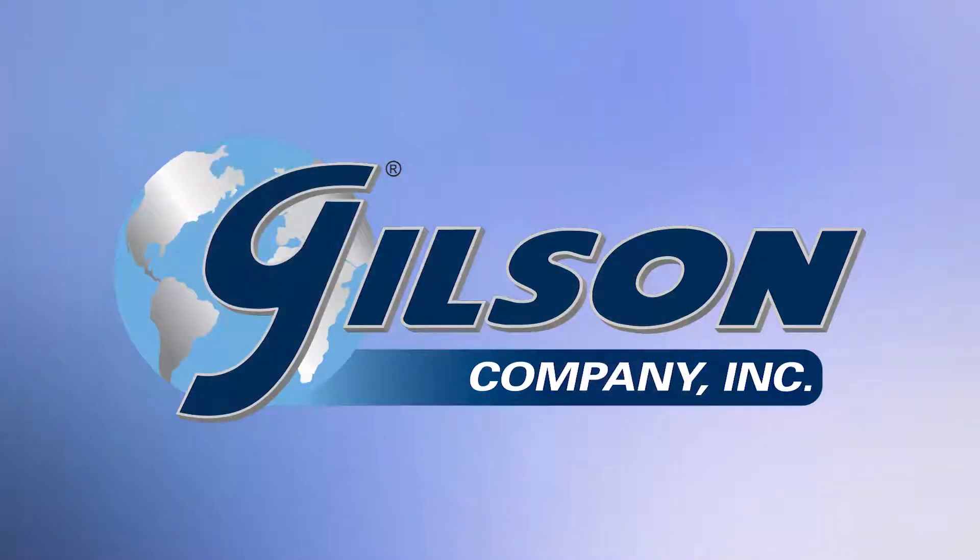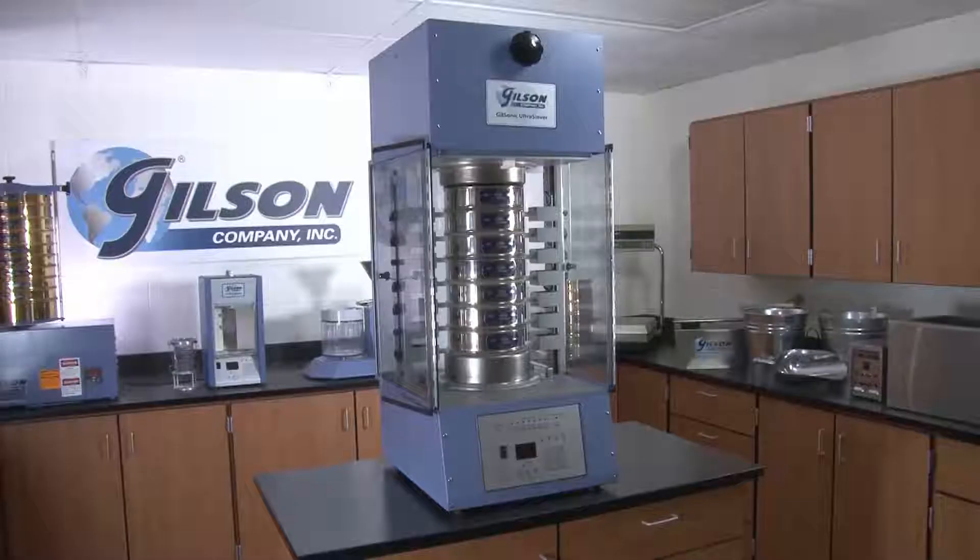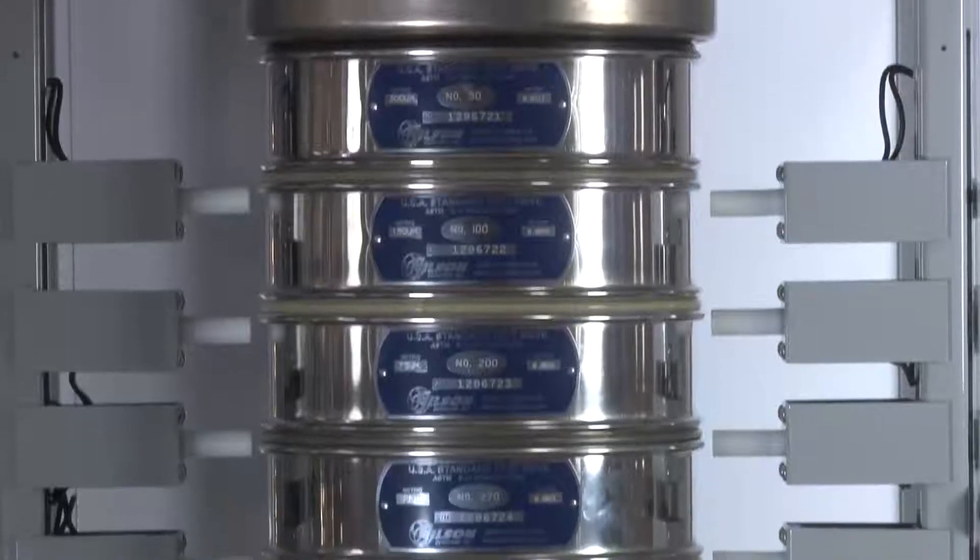Let's take a look at some of the exclusive features of the Gilsonic Ultrasiever Sonic Sifter, which combines proven sonic technology with the latest in digital control for fast, accurate sieve analysis of granular materials and fine powders.